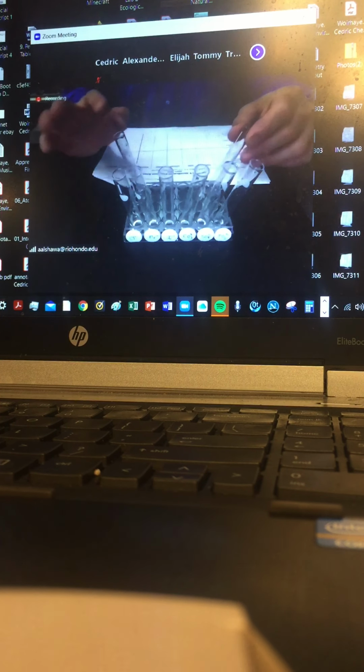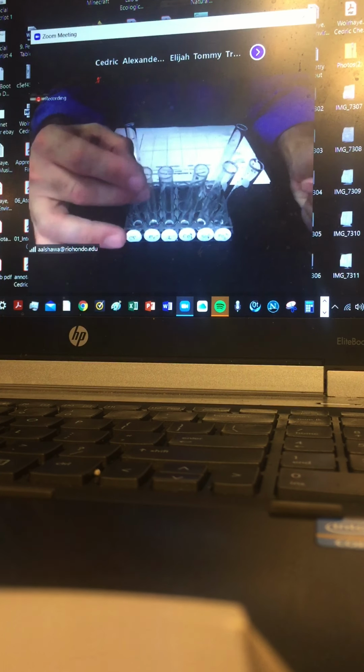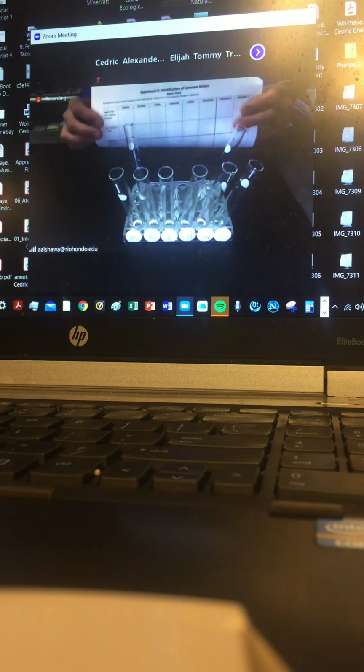So I have unknown number 1 and unknown number 2 seated in the back of that stack. Okay, so any question about the layout? Just want exactly what we have on that sheet.